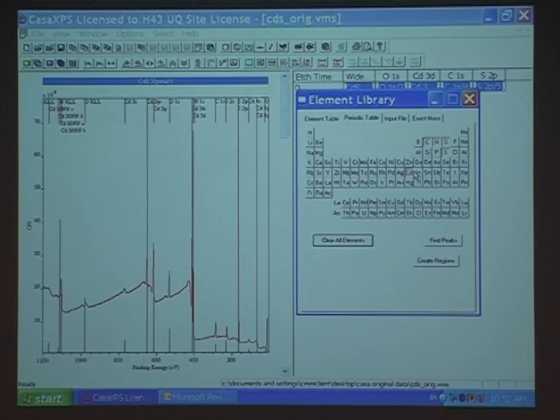If you look in the handbook, I've got the spectrum of cadmium would have all these peaks. Here's Auger peaks. There's cadmium. These are the main peaks, the 3D. There's all these other peaks. It's also picked up sulfur. Good. There's two peaks for sulfur, the sulfur 2P and the sulfur 2S. And it's also picked up carbon. And it said there's a little bit of nitrogen there. Don't believe it. That's because cadmium's being interpreted as being nitrogen.